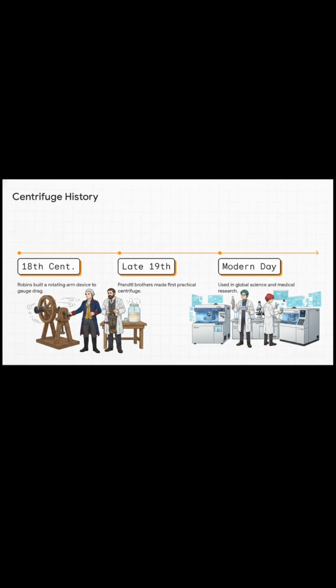Crazy, right? But then, moving to the late 19th century, the Prandtl brothers took that same concept and invented the first practical centrifuge for something entirely different, separating milk from cream. And from that dairy farm tech, it evolved into the highly advanced, absolutely indispensable tools we use across global science, medicine, and industrial research today.